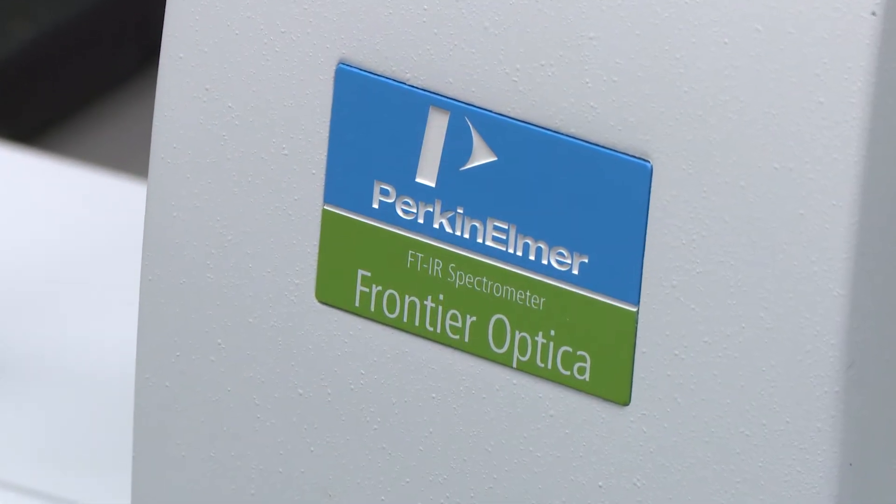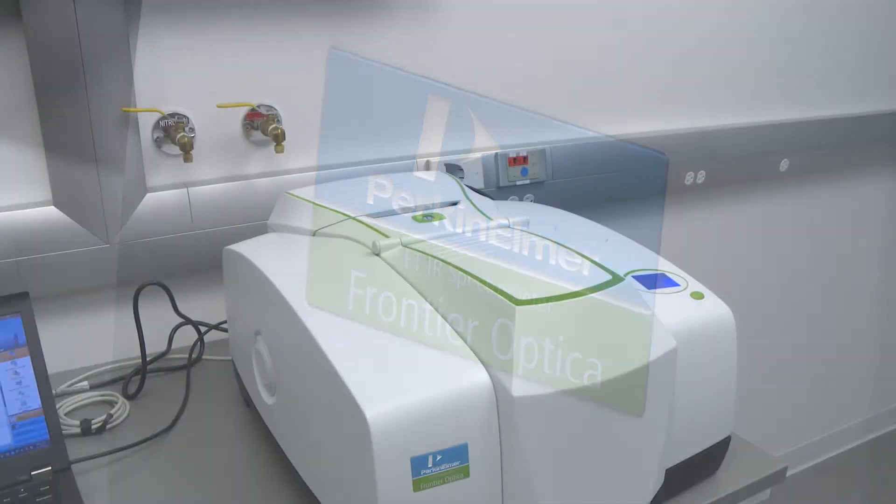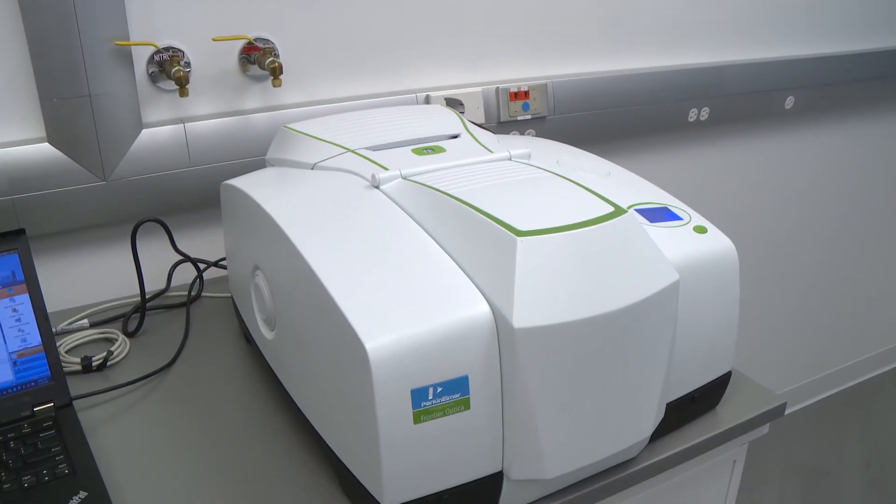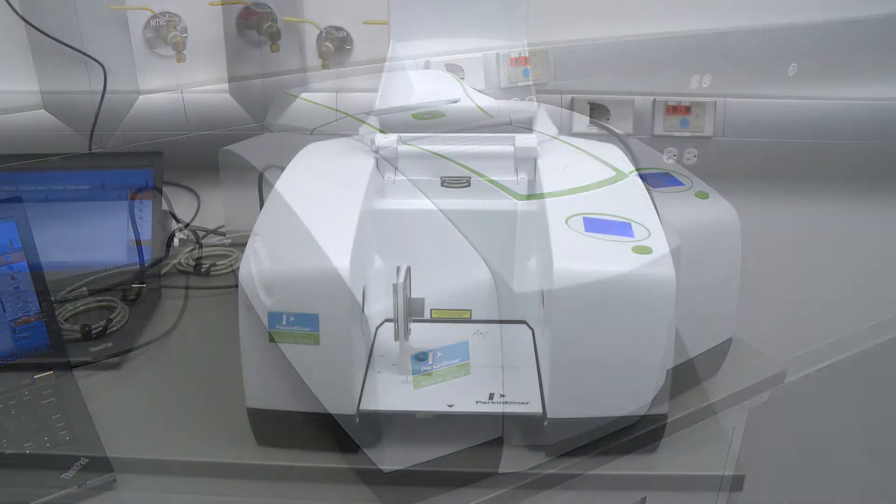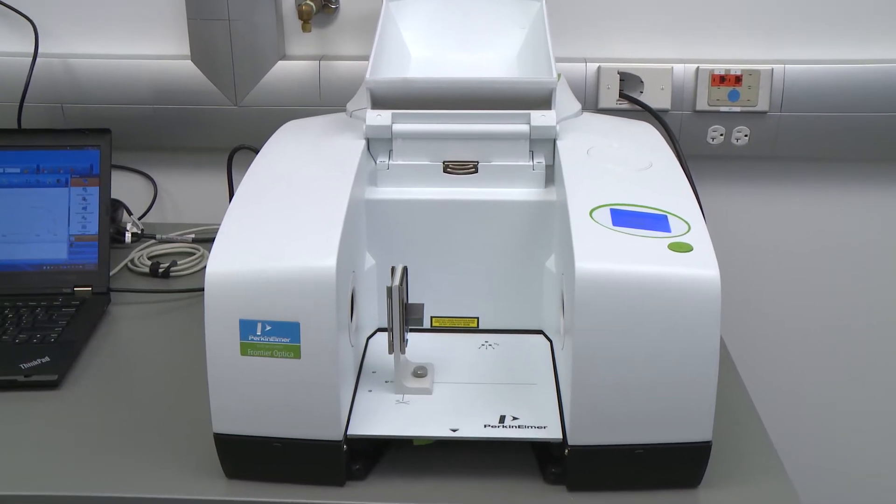Frontier Optica represents years of infrared experience and incorporates several design benefits which make it an ideal instrument for measurement of higher refractive index materials.